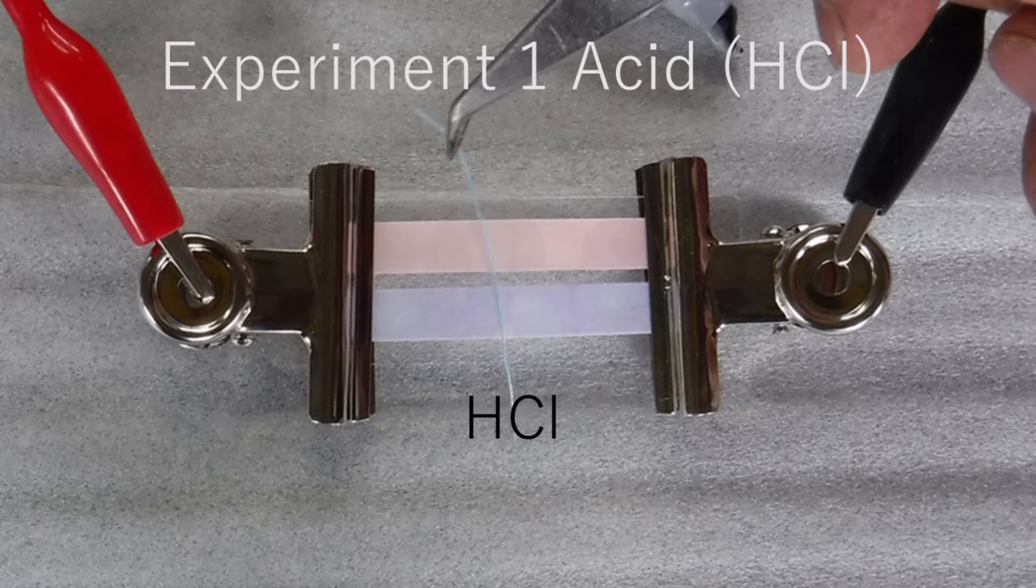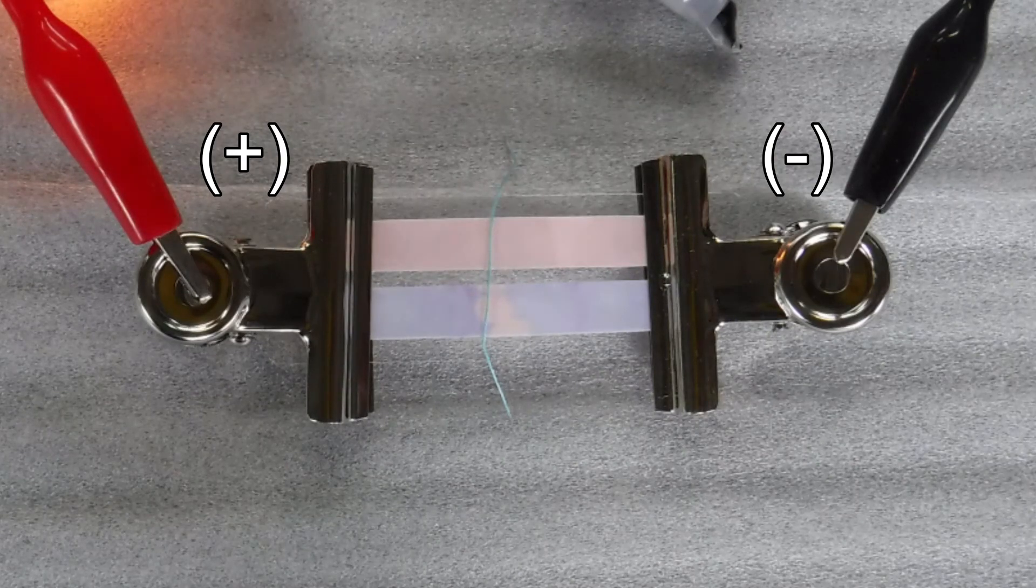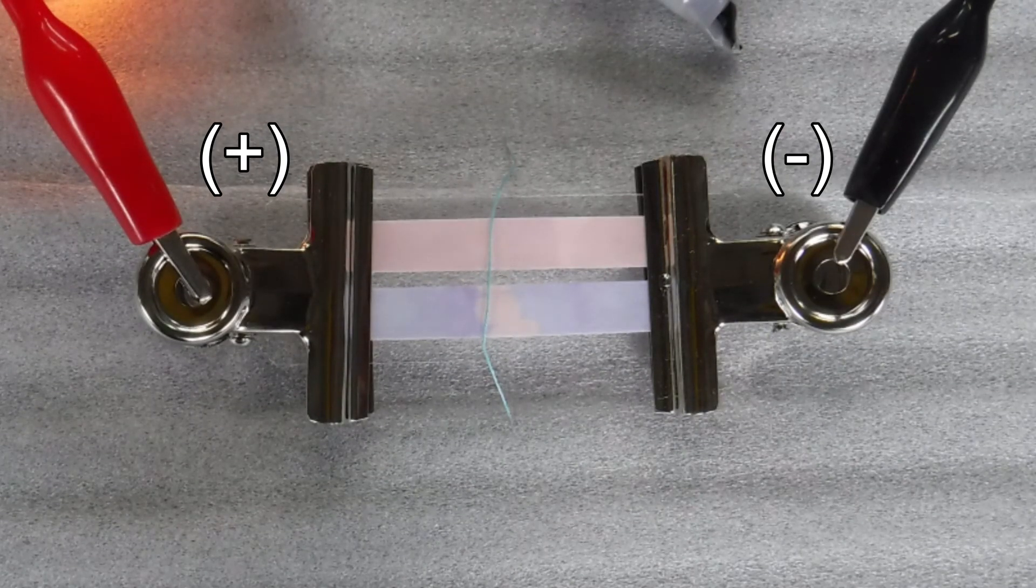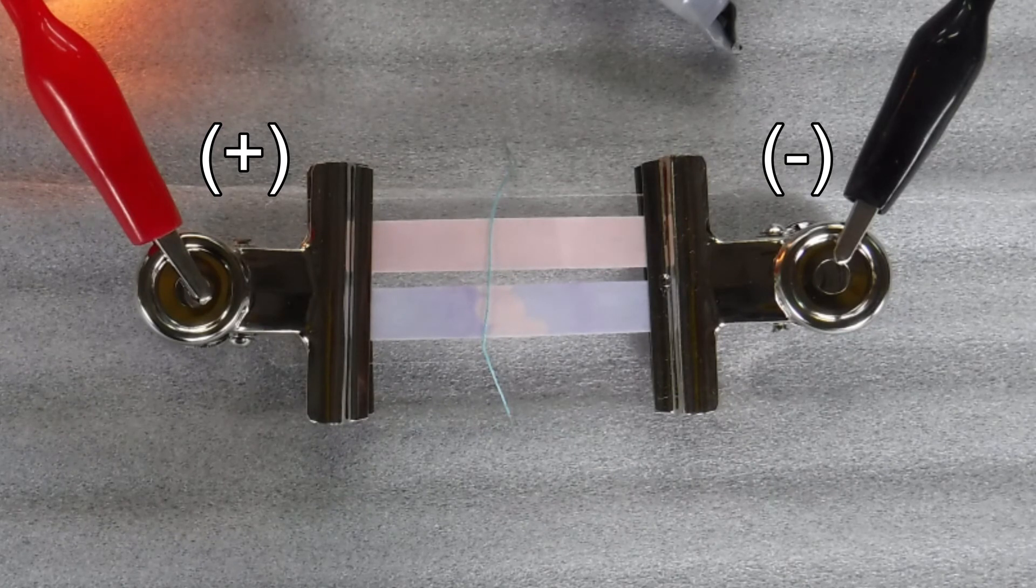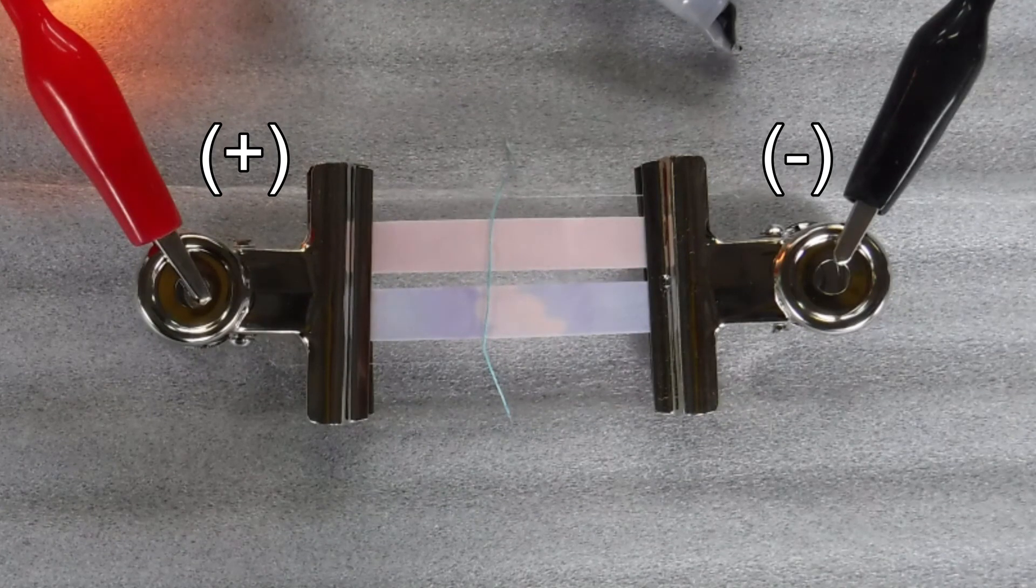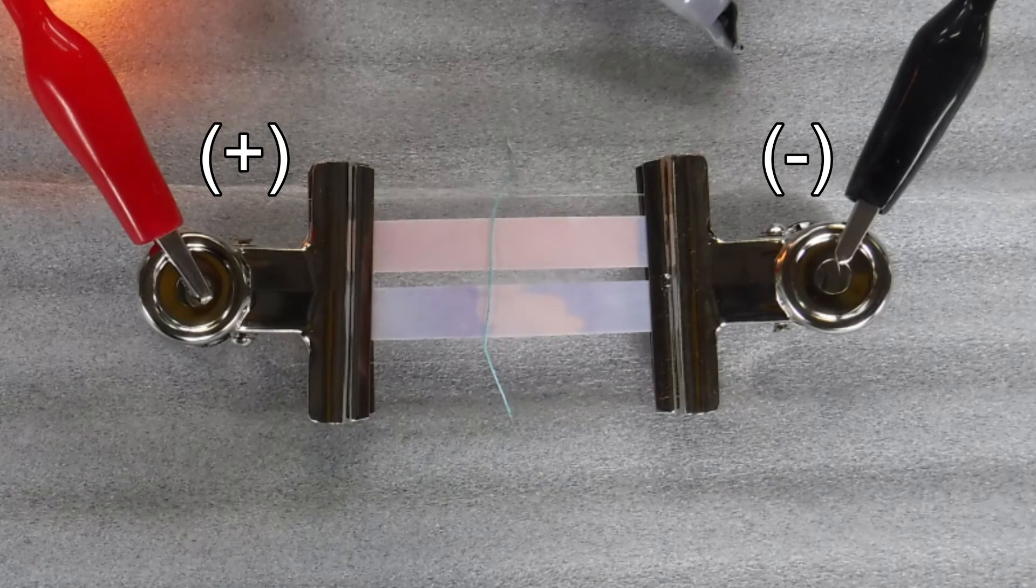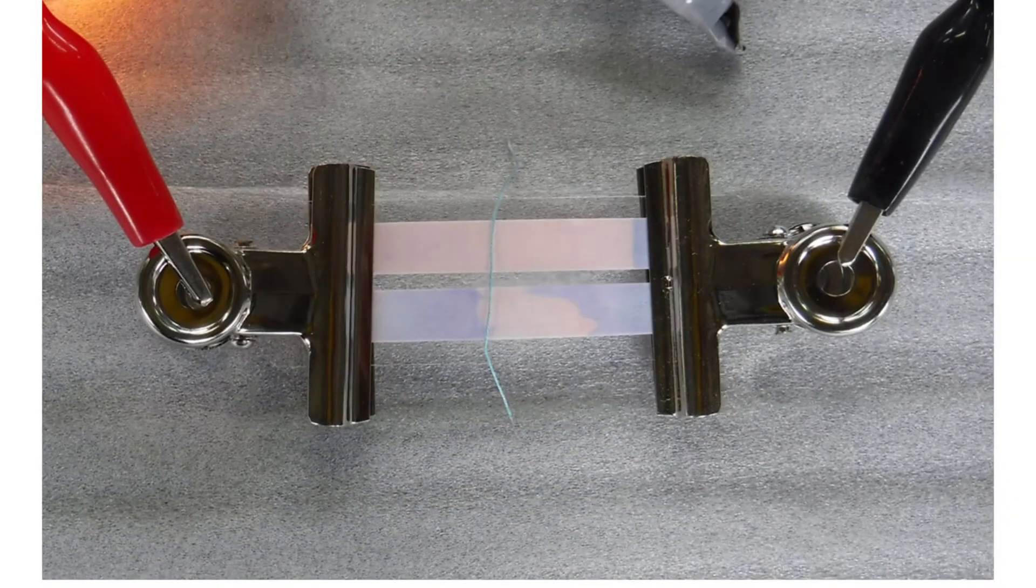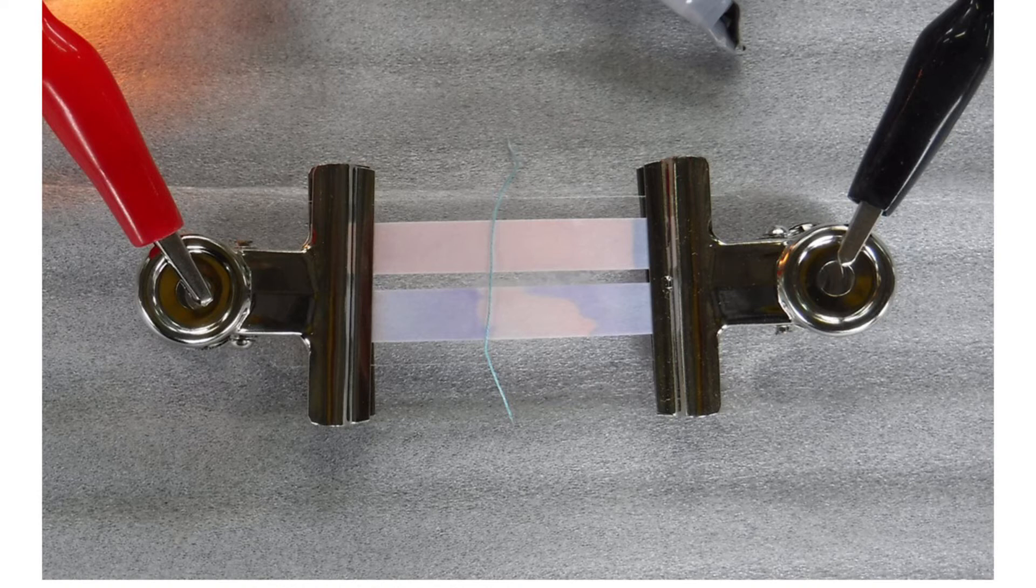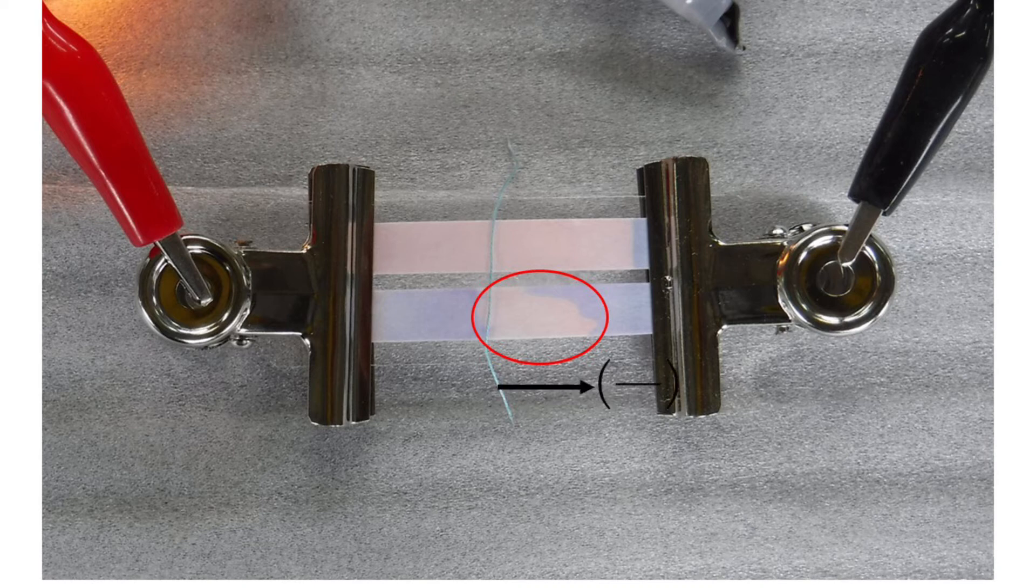A string with hydrochloric acid is placed in the middle of the paper. The experiment is started. The red part showing acidity moves to the negative electrode on blue litmus paper.